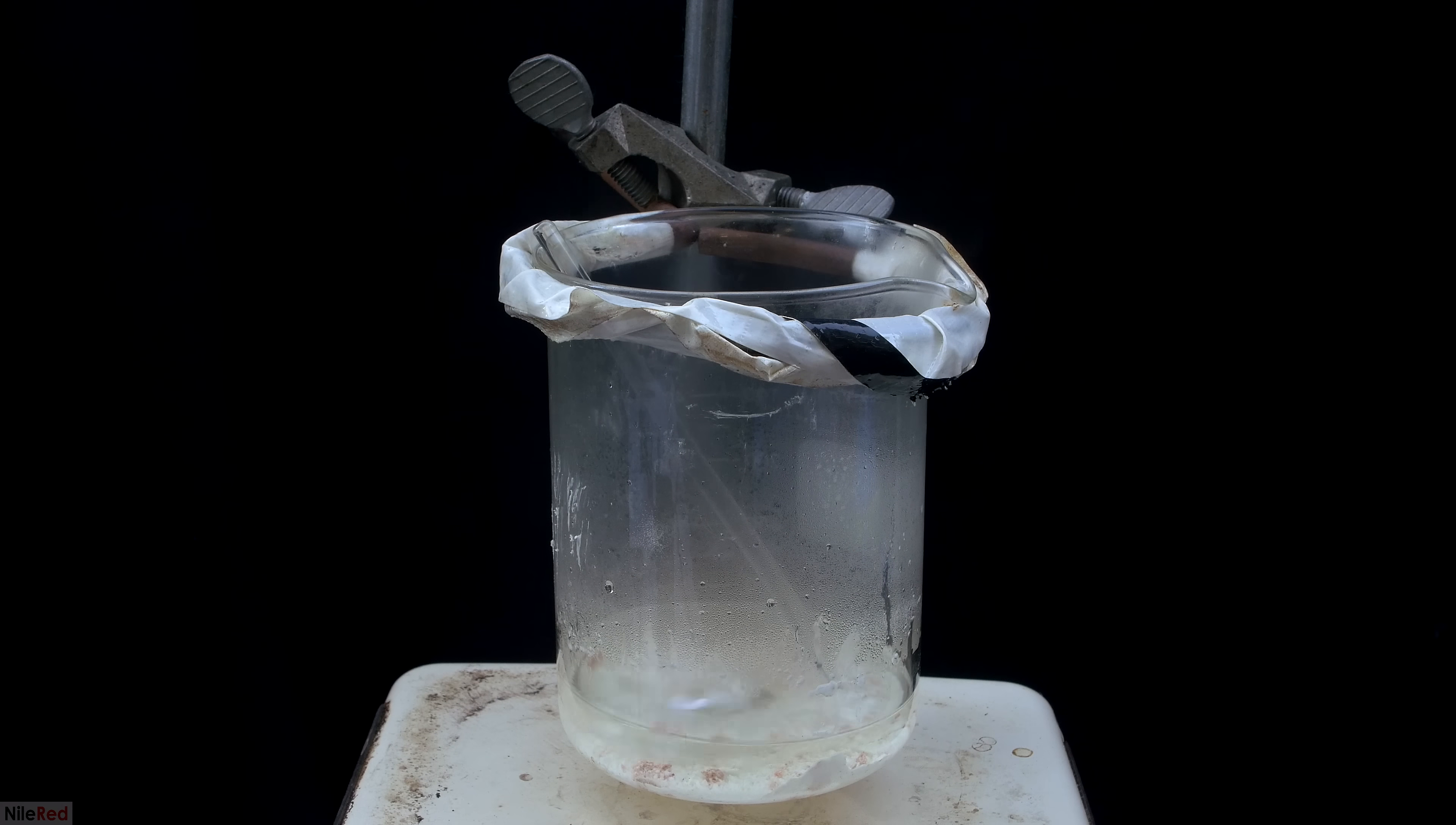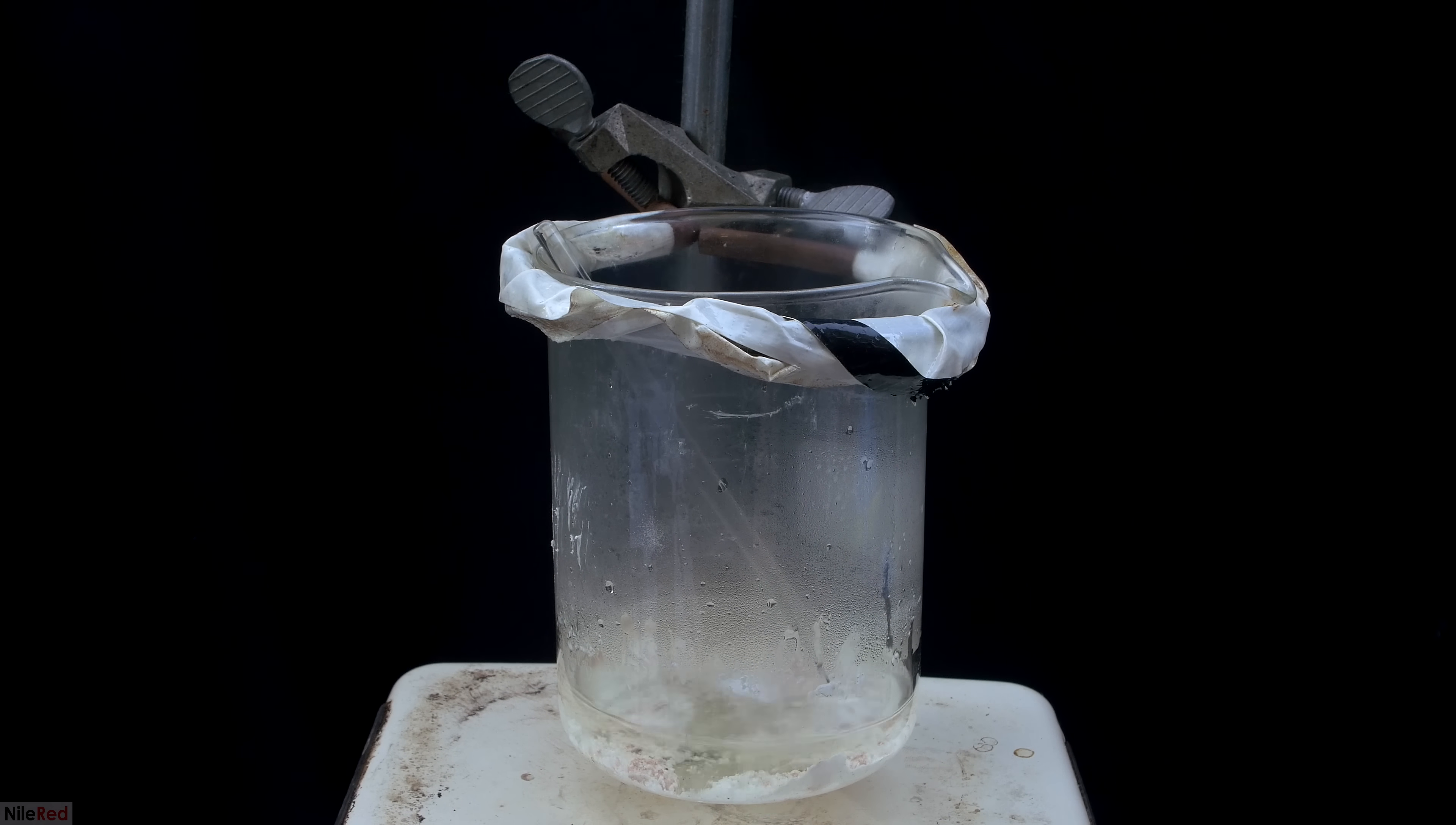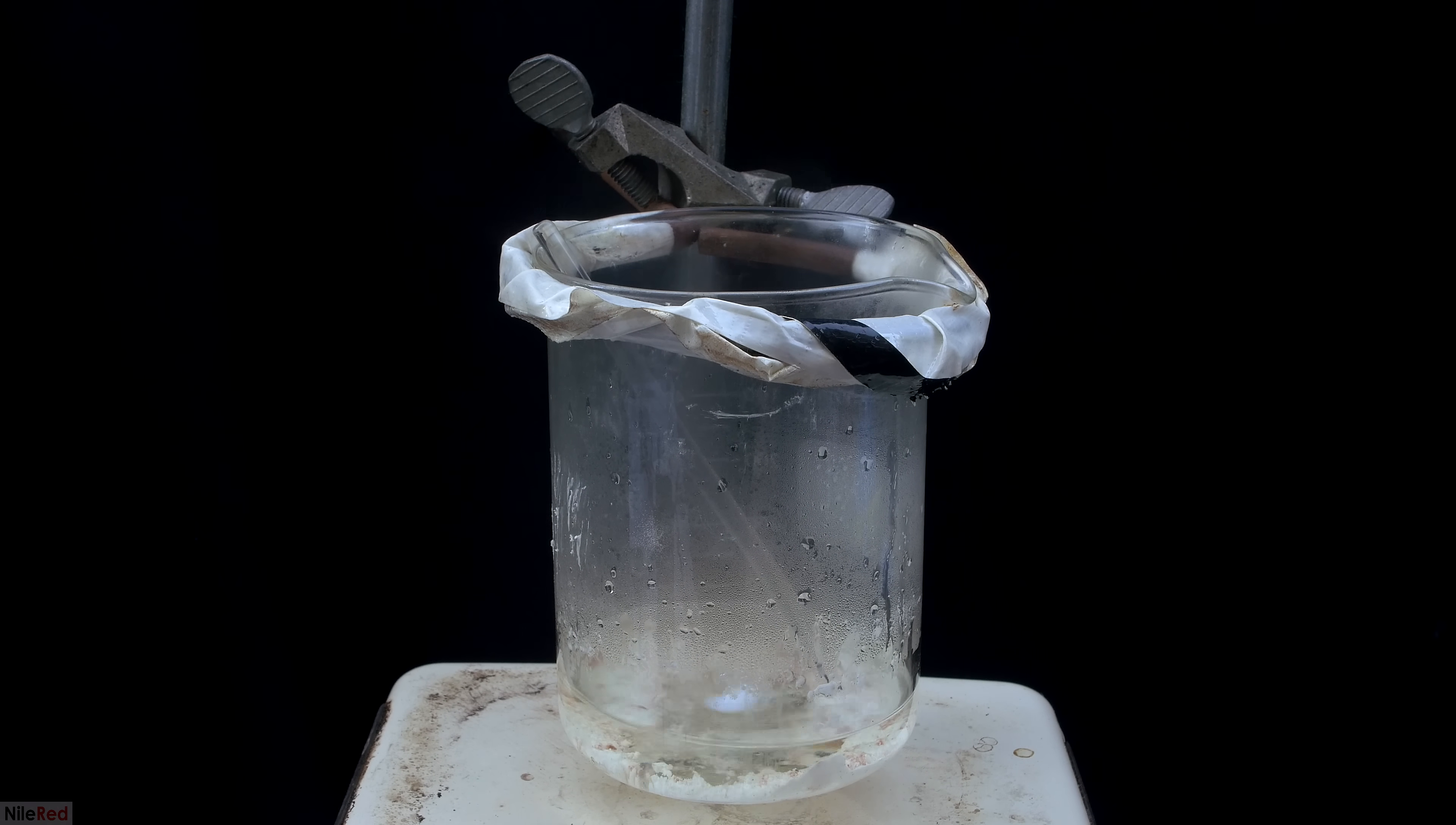Just like before, the beaker is then placed above a hot plate, and we heat things up to get rid of the water. Since we effectively added at most 60 milliliters of water, we're actually above the saturation point of mercuric chloride.